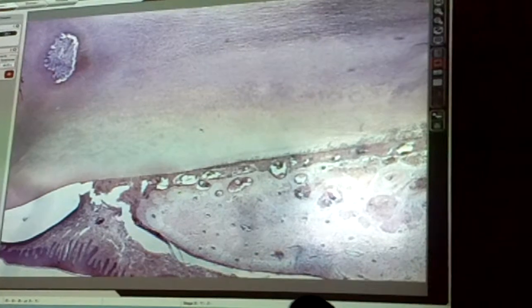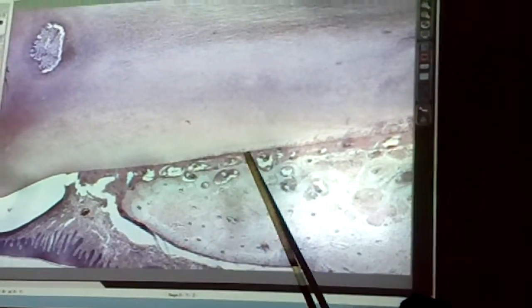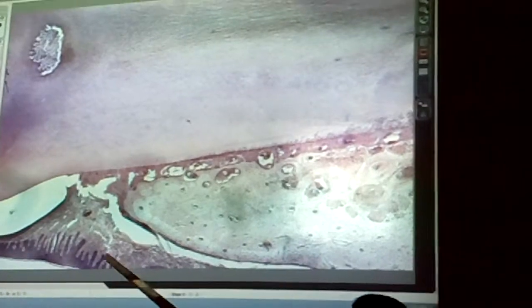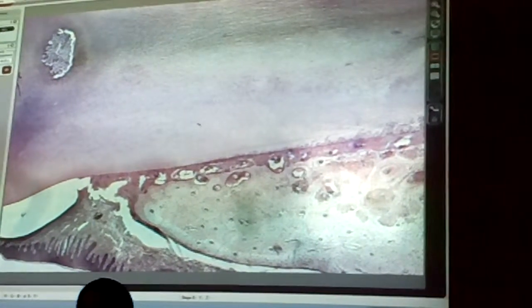That's real nice. Nice cementum there. Look at that. You don't see it very well. All that cementum. That's nice. Periodontal ligament, alveolar bone, gingiva, dentin, pulp cavity, and the area.